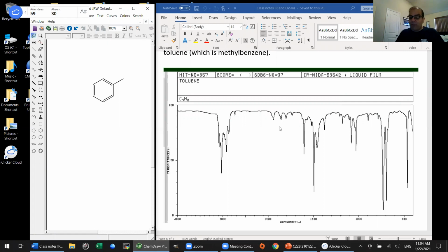That's what those literally are. And they seem to show up. There may not be exactly 4 of them, and they may not be in exactly that place. But I usually see them round and about 1,700 to 2,000 wave numbers, give or take, somewhere in there. And if you see a few nice little peaks like that, typically that's a sign that you've got an aromatic compound.